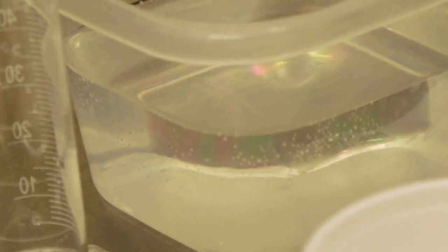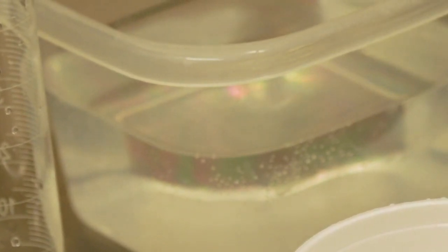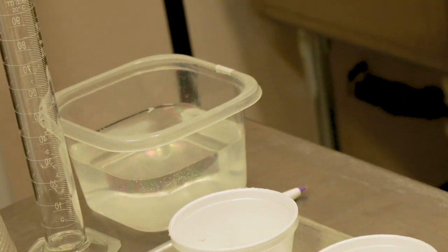You also need tap water that has been dechlorinated by aging for 24 hours, or distilled water. Tap water can be aerated during aging to enhance dechlorination.